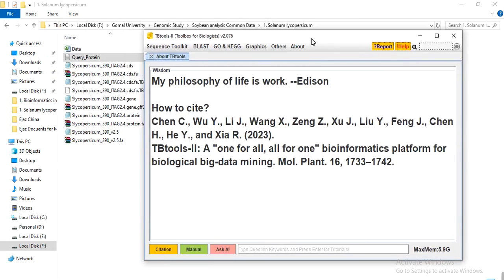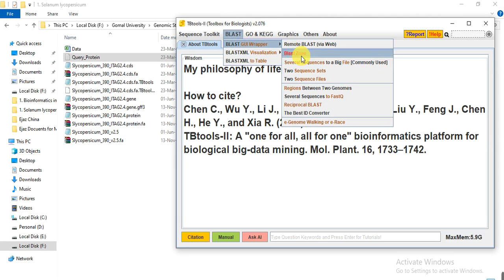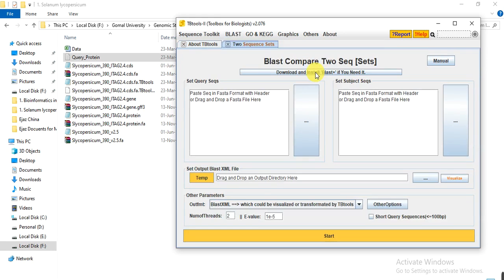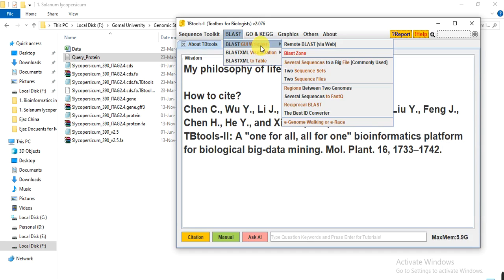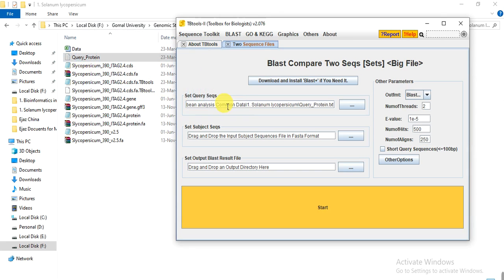Now open TBtools. I am using the latest version, TBtools 2.076. Go to BLAST, then BLAST GUI Wrapper, and here select the option for two sequence files. Click on it. Then here set the query sequence.